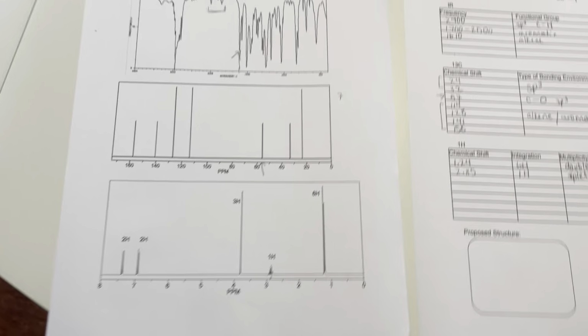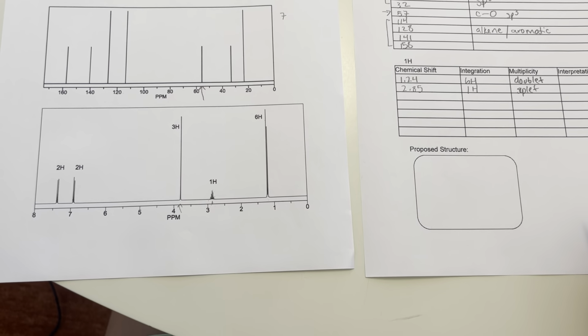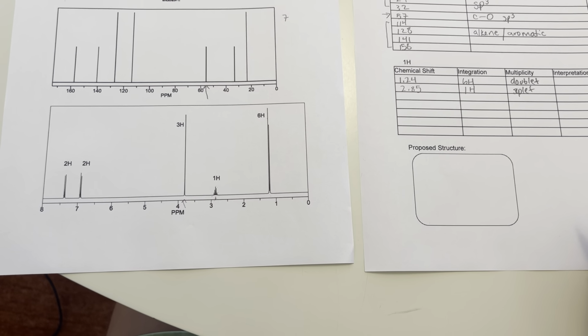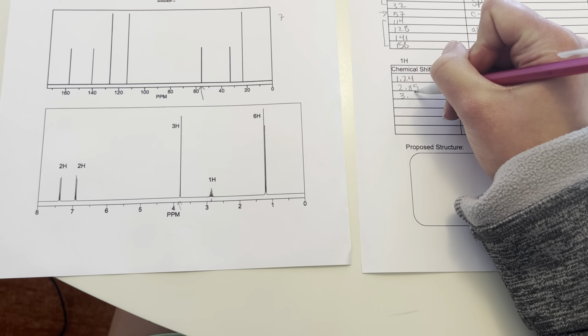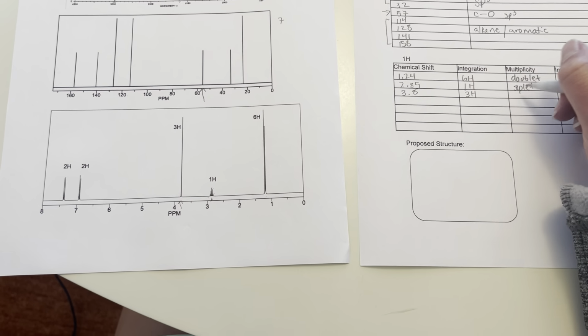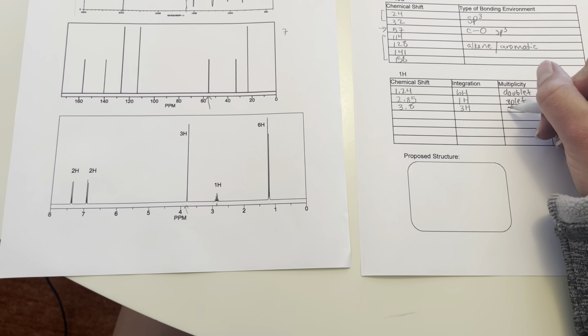And then the next one is like 3.8, let's call it, and it's 3H, and it's looking like a singlet.